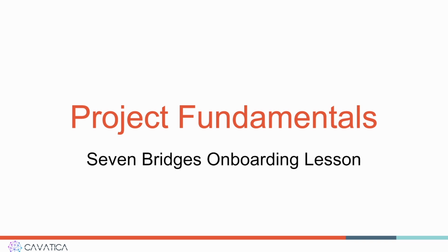This video, Project Fundamentals, will instruct you on some of the basic functionality of the platform and explain the basic organizational unit, the project.